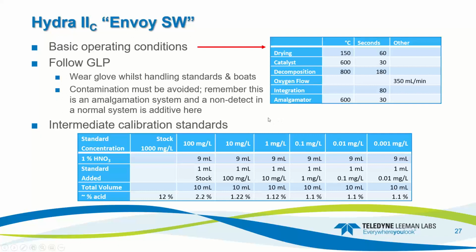And I cannot stress enough how important good laboratory practices are when making this calibration. You should wear gloves when you're handling the standards and the boats themselves. A non-detect on a flow-through system is going to be additive because this is an amalgamation system, so every little bit adds up.